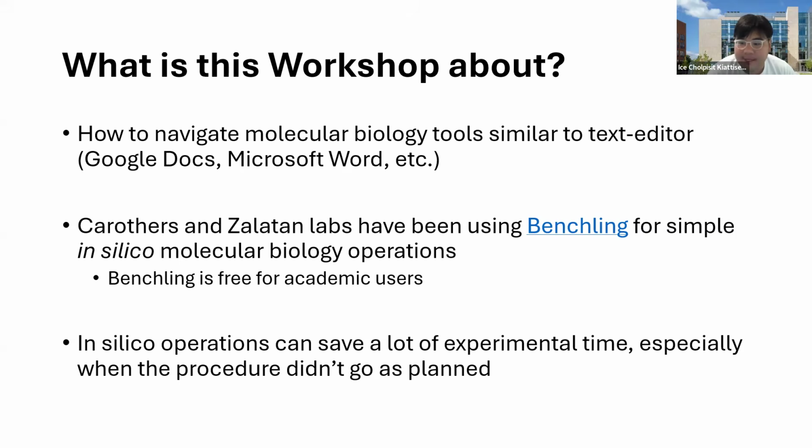Our labs have been using Benchling for some simple molecular biology operations. One reason we've been using it is that Benchling is free for academic users. If you turn into an industry researcher, your company may have to pay for it. But so far, it has been a pretty good tool for us in the past few years. For me, at least 6 years so far.